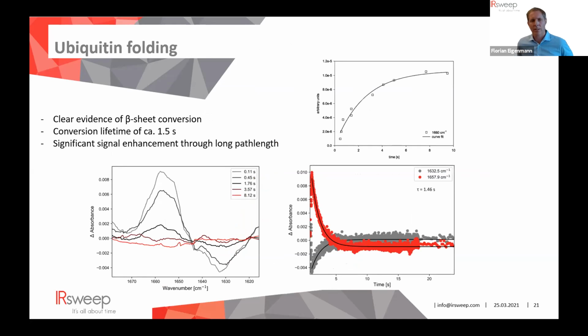Another result with a very good signal-to-noise ratio was the ubiquitin folding, where we observed clear evidence of beta sheet conversion with a lifetime of 1.5 seconds.